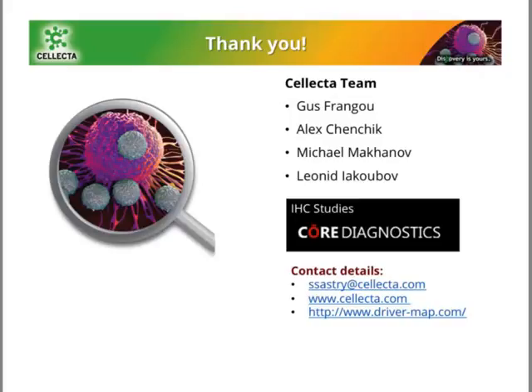Okay, so what kind of specimen is needed for a blood assay? Again, these are questions where we try to understand your workflow, and we try our best to work with you on what is available. If you're looking at extraction of total RNA from blood, that is something we could use CLIA certified partners to handle specimens for. But you can also send purified RNA, either from whole blood or from PBMCs. I hope I've answered that question.